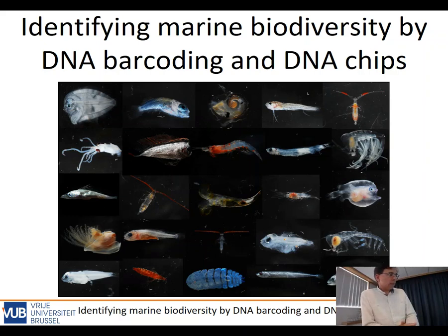I will give a short presentation about genetic methods to identify species, in particular marine species. And here you can see a couple of zooplankton organisms, pictures I took on a cruise in the Atlantic Ocean. So you have a huge biodiversity of early life forms in the zooplankton. You have fish larvae, crustaceans, you have eggs of all kinds of organisms, mollusks, whatsoever. And identification is a major problem, especially of early life history stages.